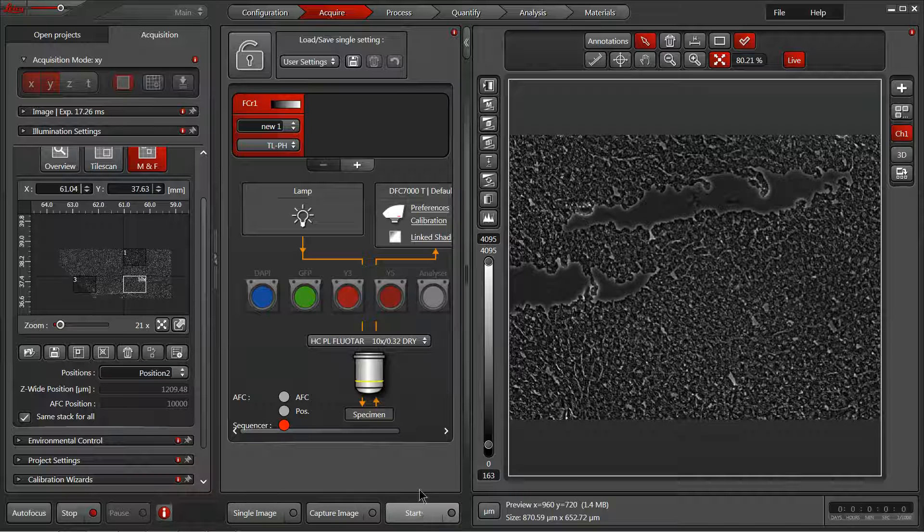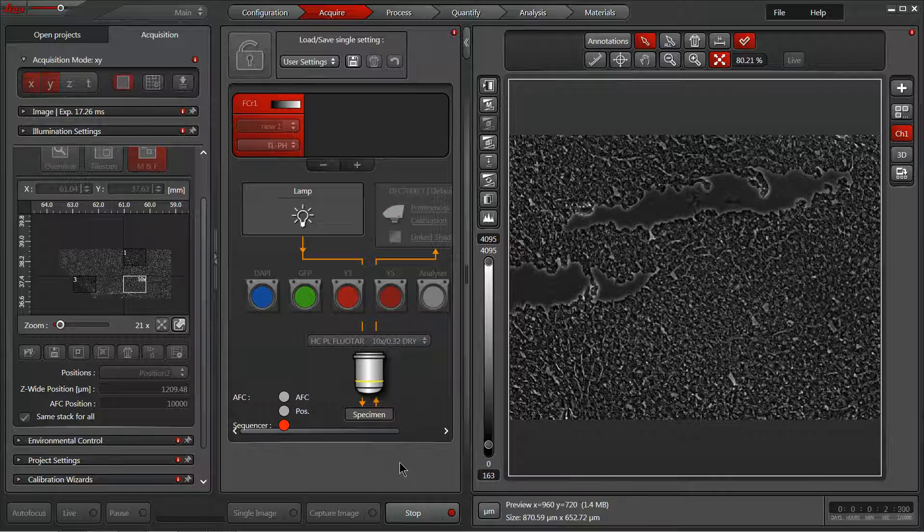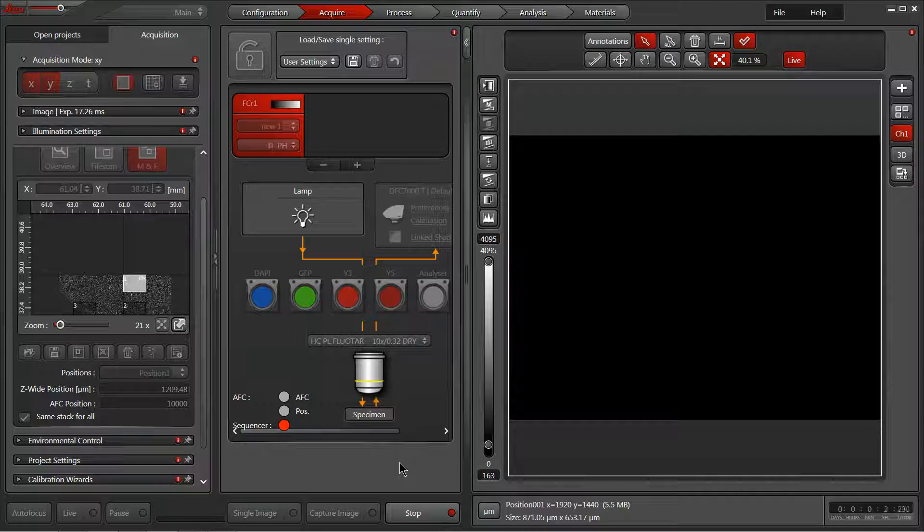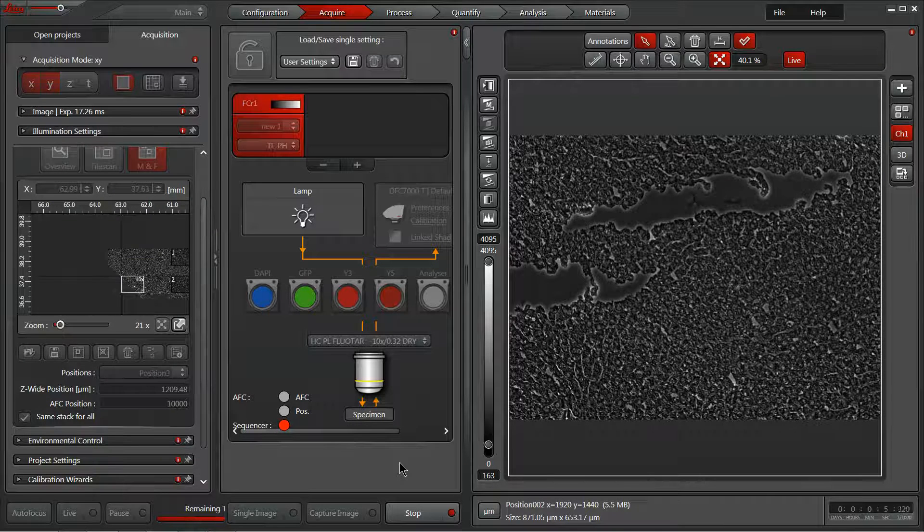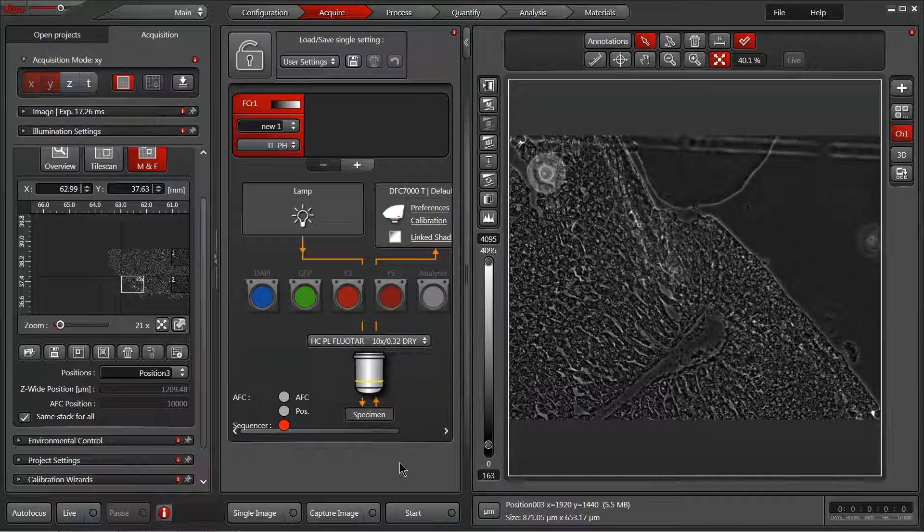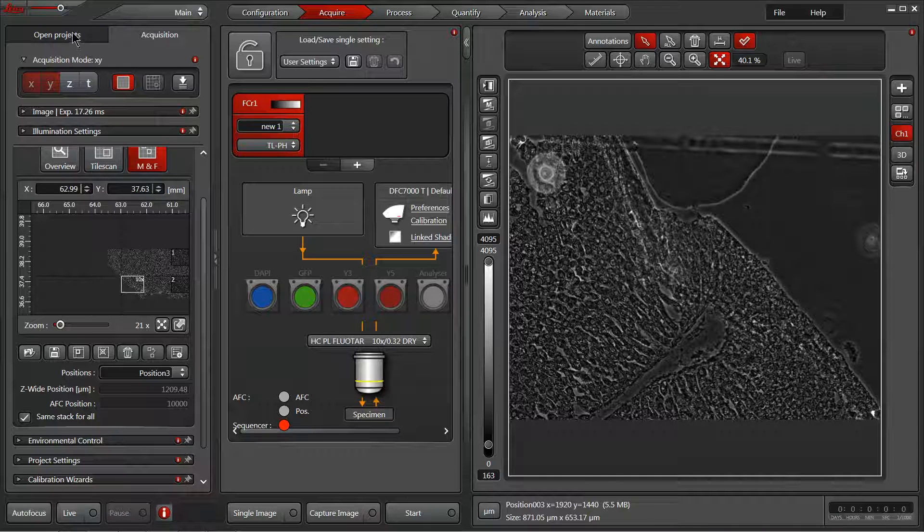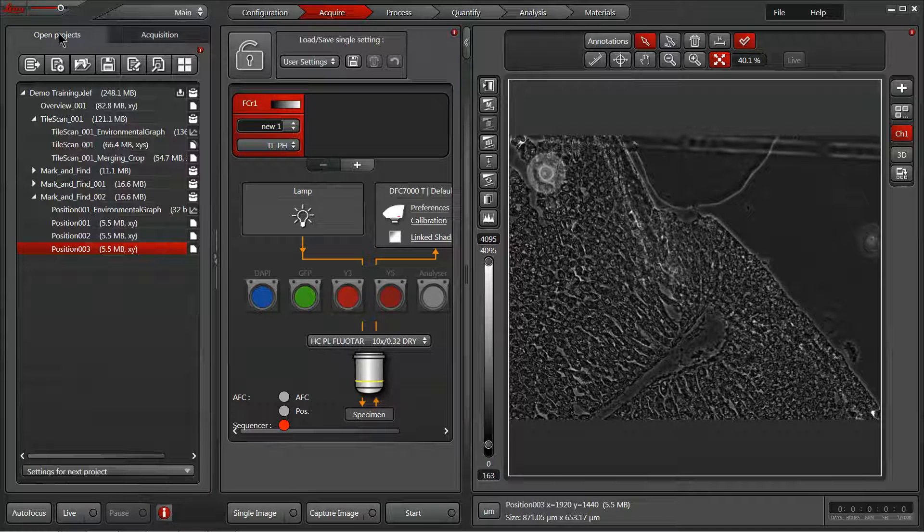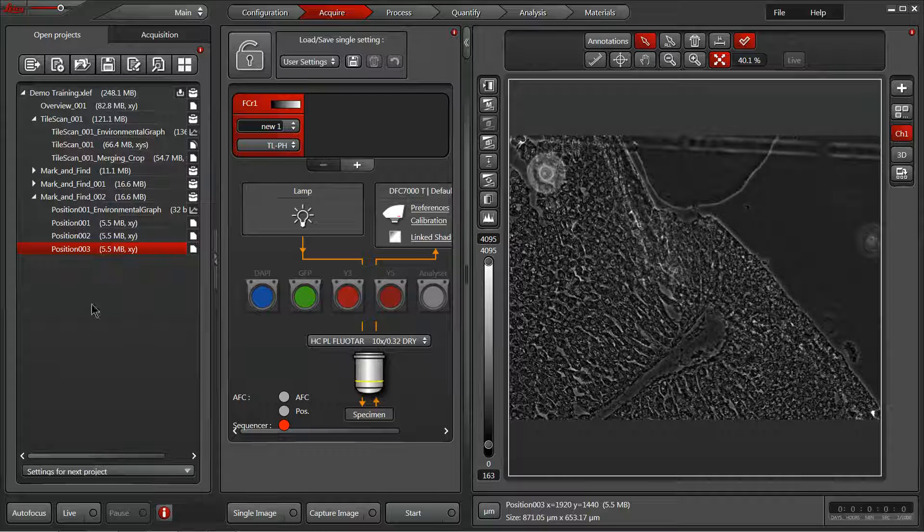After the experiment's prepared, the system will automatically move from spot to spot, and in the end it'll show our final image from the last stage position in our preview window. But if we go back to our projects tab, we can find positions one, two, and three separated here, all prepared for downstream analysis or presentation.